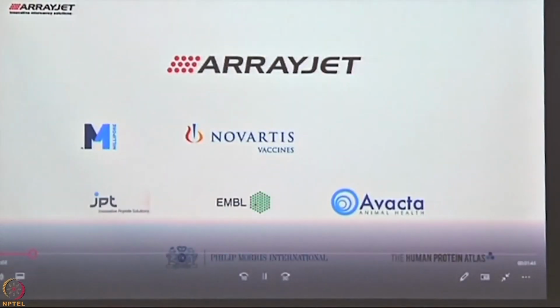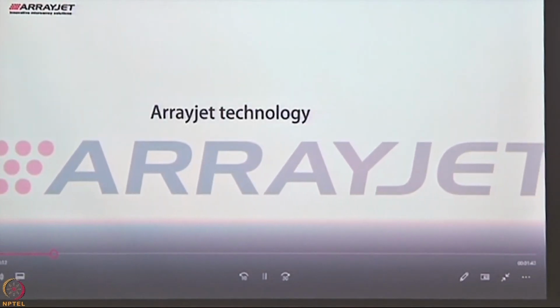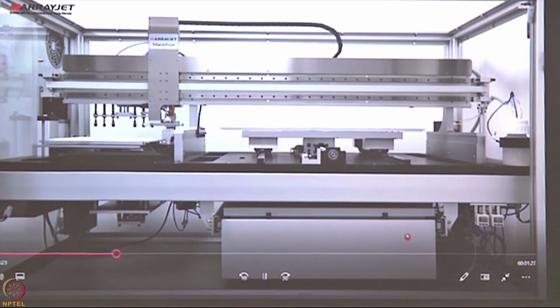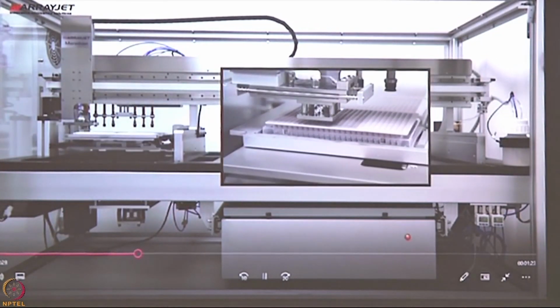So this is how the technology really works, how the printing is done. You can see this is the platform. You've got a tray of 25 slides and that's how it moves. Each time it moves, it prints 12 samples on one slide, second slide, third slide, fourth slide, till 25 slides in an on-the-fly motion.